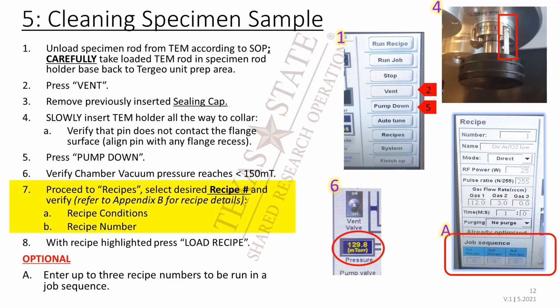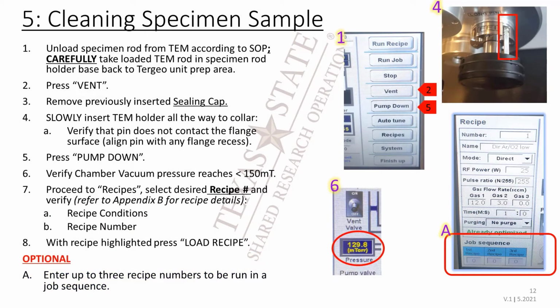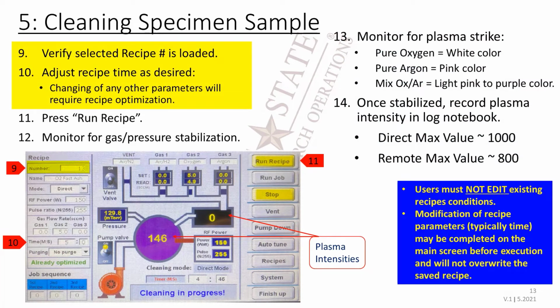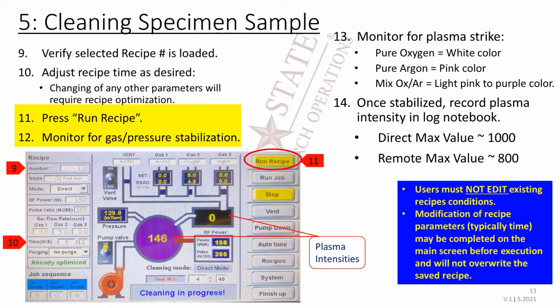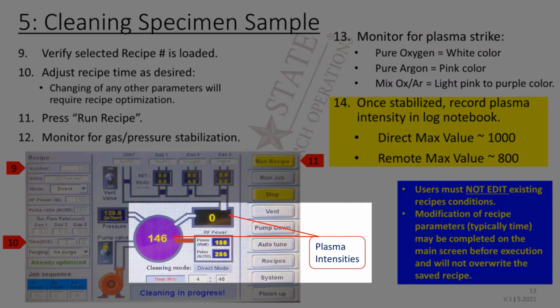Proceed to the recipes. Select desired recipe number and verify the recipe conditions and the recipe number. You can also enter up to 3 recipe numbers to be run in a job sequence. With recipe set highlighted, press Load Recipe. Verify your selected recipe number is loaded and adjust recipe time as desired. Press Run Recipe and monitor for gas pressure stabilization. Monitor for plasma strike. Once stabilized, record the plasma intensity in the log notebook.